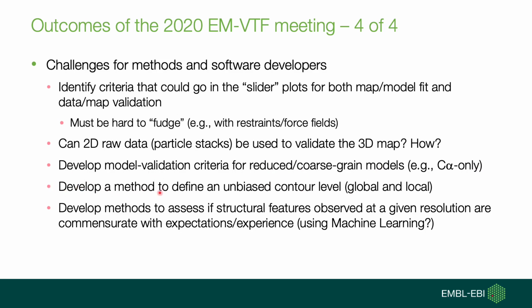It would be fantastic if we had a method that could define an unbiased contour level, both globally and locally. And it would also be very helpful if there were methods to assess if structural features observed in a given map are commensurate with what you expect for the resolution that the map is at.